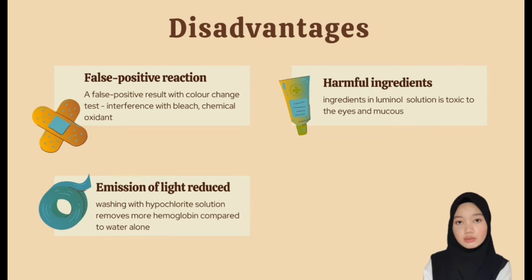Not to mention, the medium where the test is carried out is composed of sodium hydroxide, soda, hydrogen peroxide, and sodium perborate. These components are considered irritating to the eyes and mucus, thus the use of personal protective equipment is essential. Not to mention, federal departments don't control the sale of this product, and only a few studies about its toxicity are available in the literature.